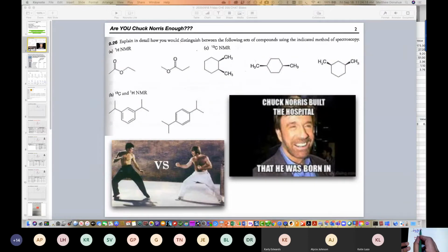Then the methynes, 1, 2. Then we're now in the ring. So again, we had 3 of them that are in the ring. We have these, so that's 2. Then we have 1 and 1.